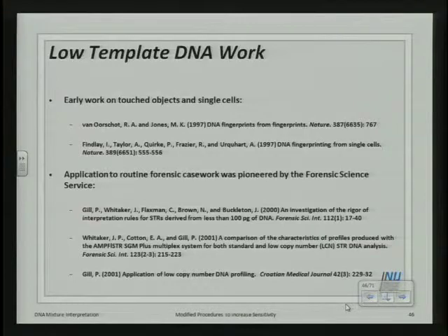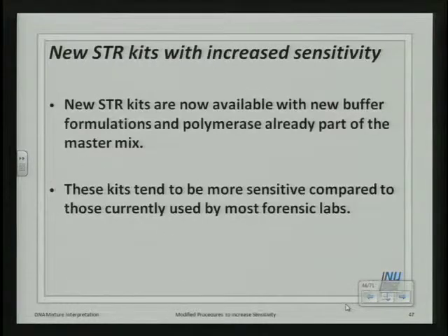There's been a lot of work on low template DNA testing. Van Oorschot published in Nature, DNA fingerprints from fingerprints, so from touch DNA. And of course, the FSS led the way in this technique.